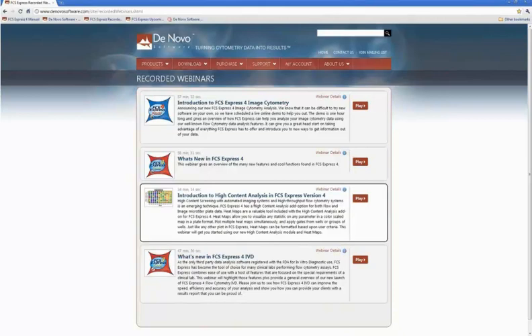So if you want to look again at the highlights or at the content of today's webinar, you will be able to see that starting tomorrow, or pass around the link to other people for them to look at it as well.